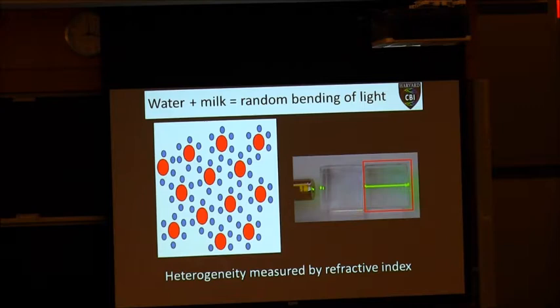So how do we figure out how homogeneous or heterogeneous a mixture is? Because obviously I can pour water and ethanol, let's say, together into one of these cubes, and it's going to look just like this. It's not going to look like that. Okay? And the reason for that is water and ethanol have a very similar refractive index. So what that means is they have a very similar ability to scatter light, to absorb those photons that are coming in for that brief period and then re-emit them in another direction. So as long as substances have very similar refractive indices and are doing a similar amount of scatter, you're going to get a homogeneous solution, or it's going to look homogeneous to the light that's going through it. It's when things are heterogeneous that you get all the scatter and that sort of white cloudy look that we see in biological tissue.